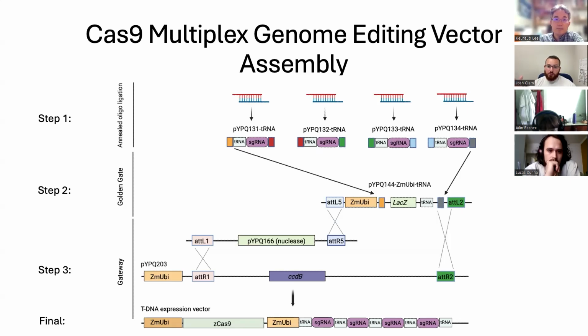So you get equal coordinated gene expression through all of them. And there are also some mechanisms by which that RNA might be protected, with the poly A tails. So you might achieve greater expression of the guide RNAs using a Pol II promoter.